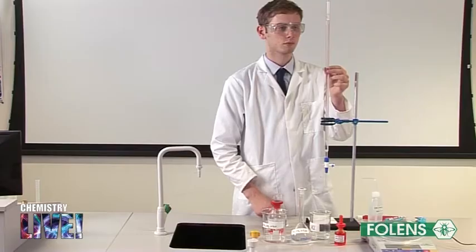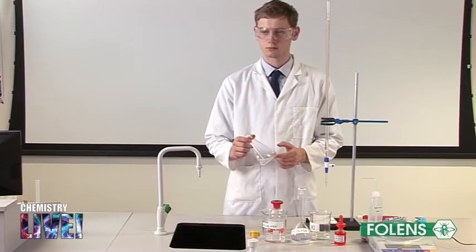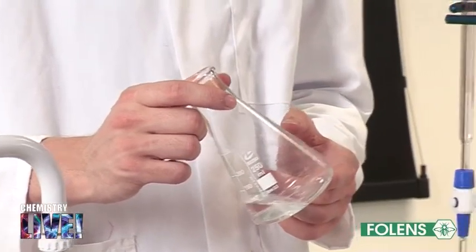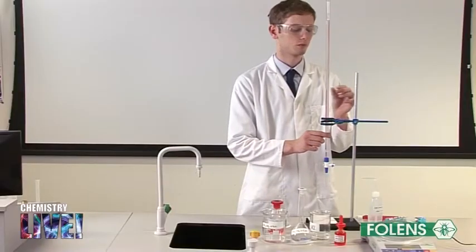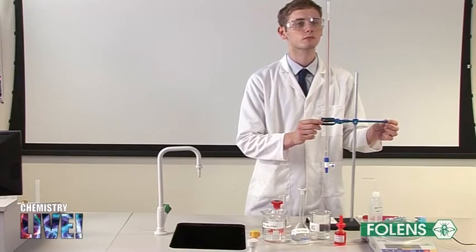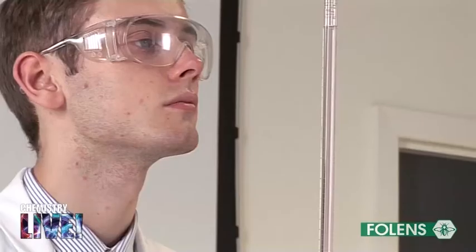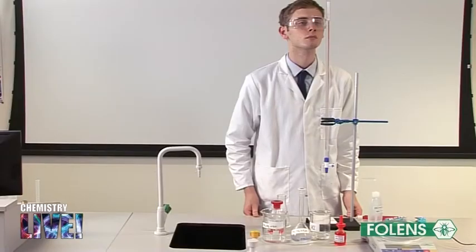25 centimeters cubed of the sodium carbonate solution has been pipetted into a conical flask. The burette is clamped vertically using the retort stand and filled to the mark with the hydrochloric acid solution. The funnel has been removed from the burette and the part of the burette below the tap has been filled. The bottom of the meniscus has been adjusted to the zero graduation mark.